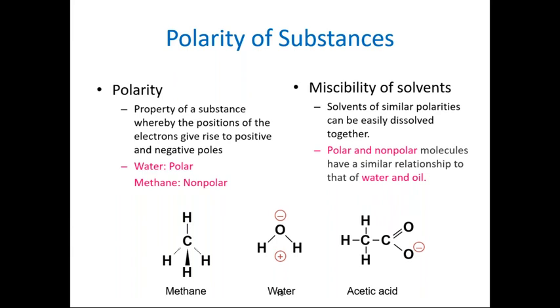The two are not miscible. So the polarity of the substances, which gives rise to either the positive or the negative polarity, is the most used property of the stationary phase and the analyte, which is used in HPLC, or high performance liquid chromatography.